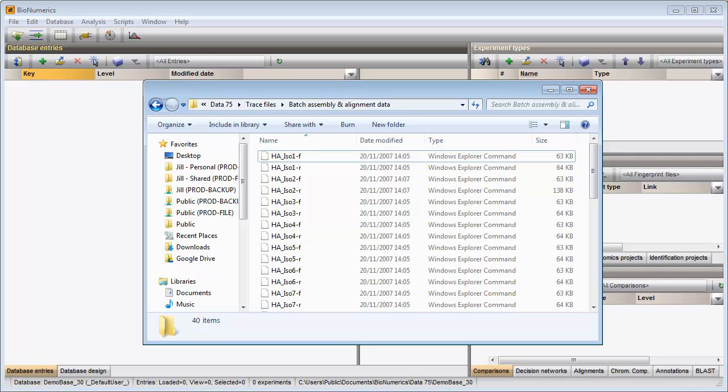In order to import and assemble these trace files in one import round, the trace files should be present in the same folder and the file names should be composed of the sample name and optionally the name of the sequence experiment.